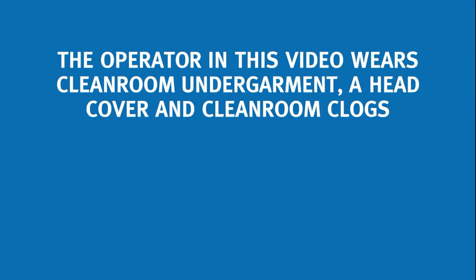The operator in this video wears cleanroom undergarment, a head cover and cleanroom clogs.